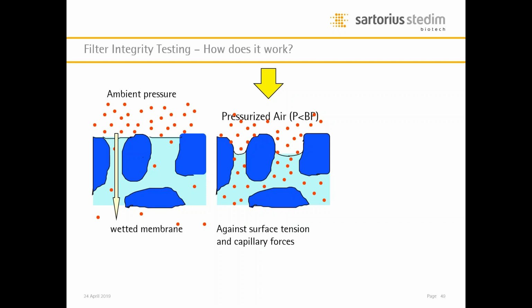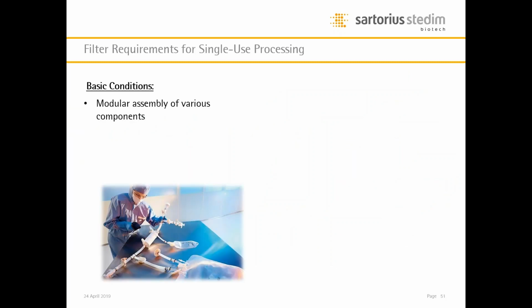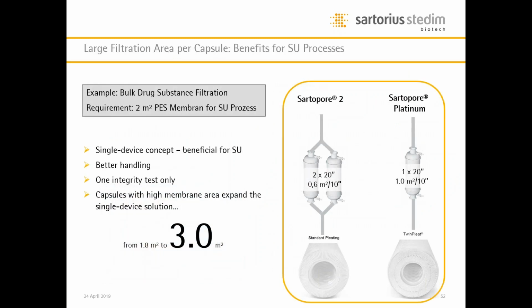And depending on the technology which is used, it's called a diffusion test, or here, when you increase the pressure, it's called the bubble point test. So, but what is really important to know? Just let me skip this slide here. What is important to know?